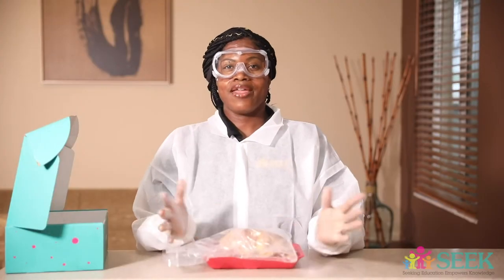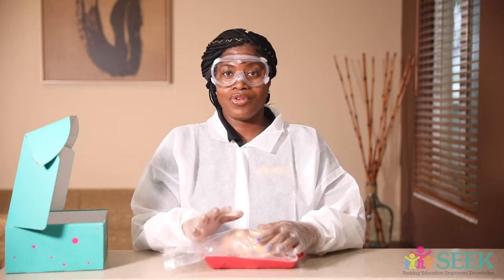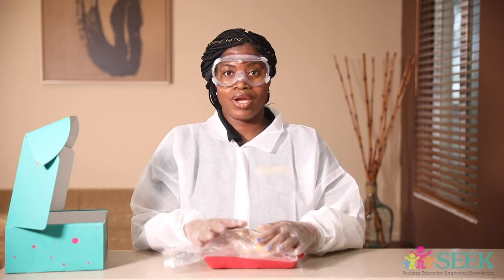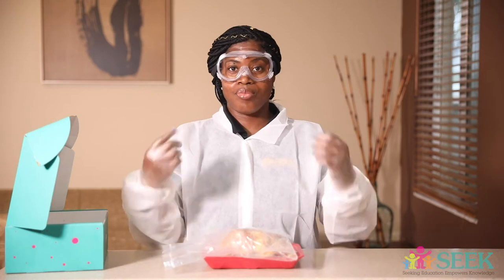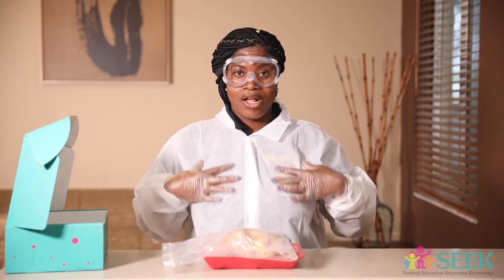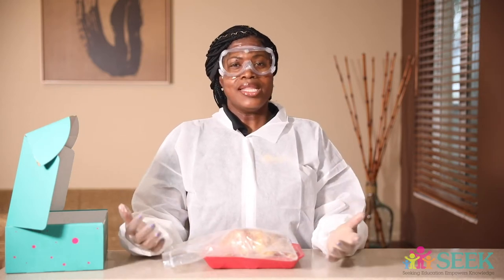All right, boys and girls. Step number one: you need to make sure that you have on proper attire when you are getting ready to dissect. And if you are underage — meaning less than 13 years of age or in the seventh or eighth grade — you do need parent assistance. And if you are in eighth up to twelfth grade, you will also need parent assistance. Make sure you have the proper equipment: hair tied back, goggles on to protect your eyes, gloves on, and a disposable lab coat. So the next step, we are going to start to dissect and look at different parts of the heart.